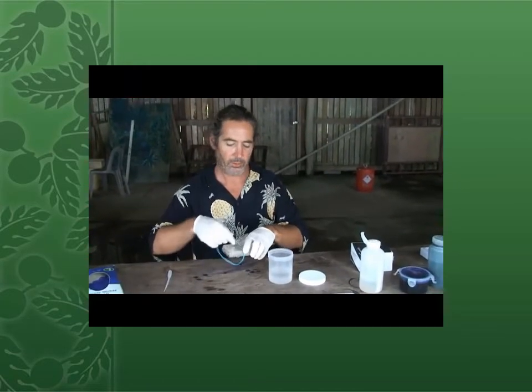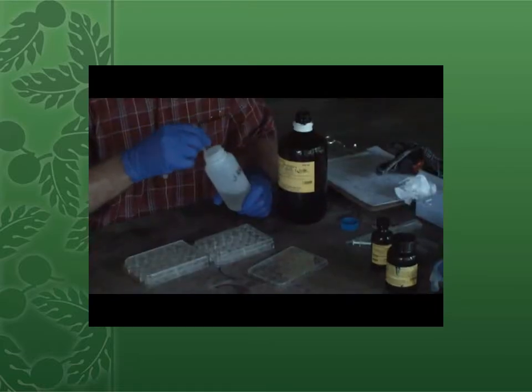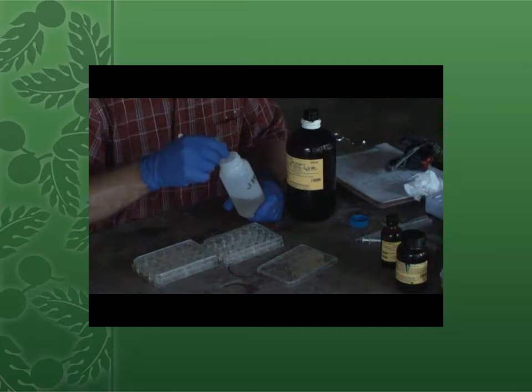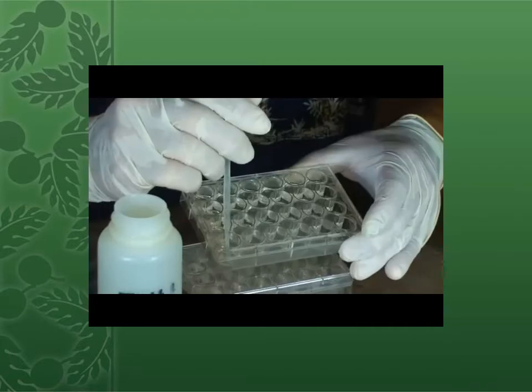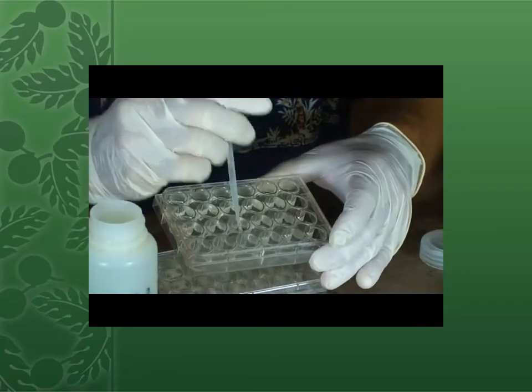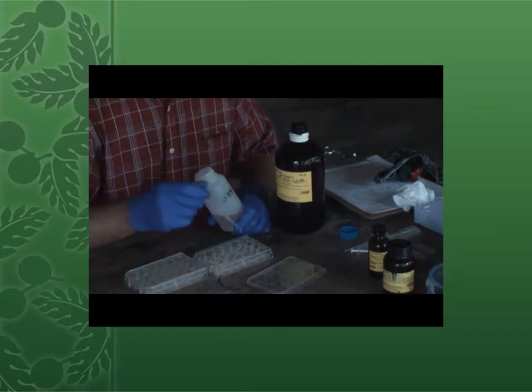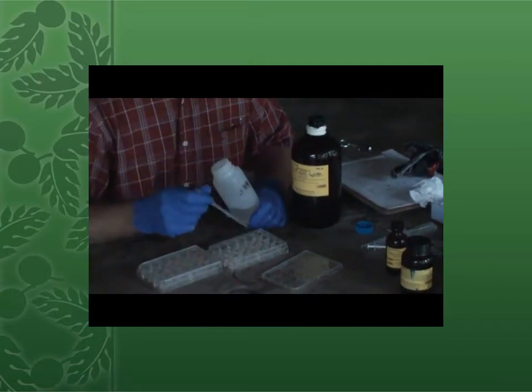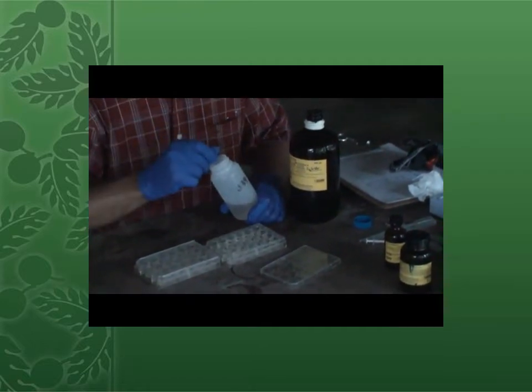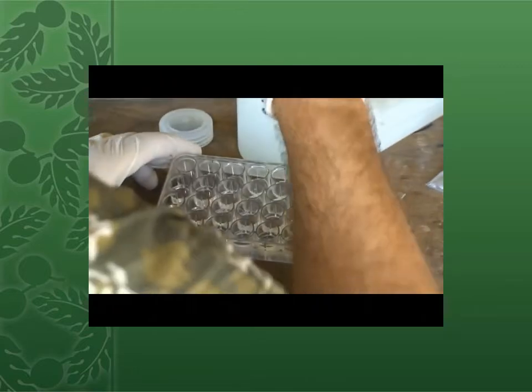Next we'll go through a process called infiltration. Remove the alcohol and add an infiltration solution. Remove that infiltration solution and replace it with new infiltration solution. And then remove that infiltration solution.